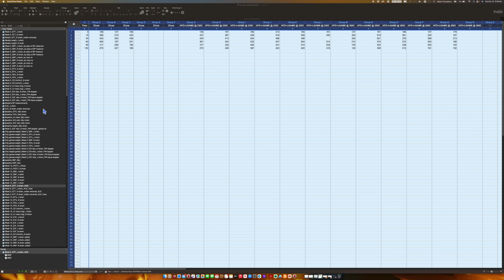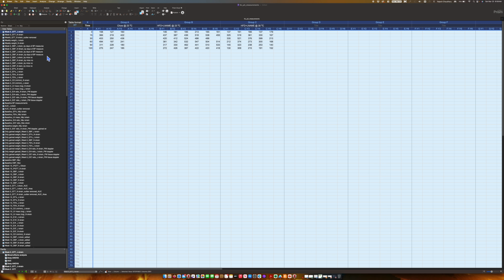the GTT, which is the glucose tolerance test in the mouse or in the human, so it's applicable for both. So I'm going to start from the data, the already existing data that I have, and I have already performed the AUC. So I'm not going to carry out the entire process here again, because it would generate multiple copies of the same file.